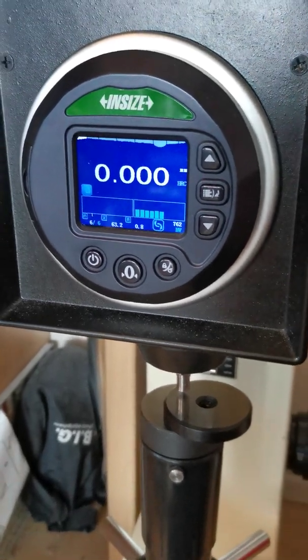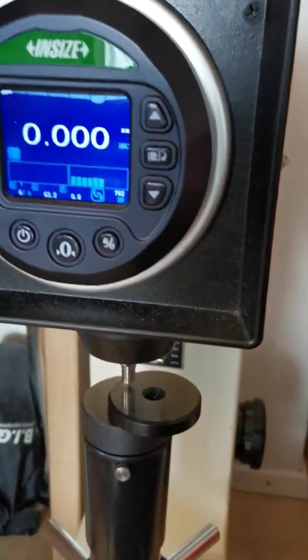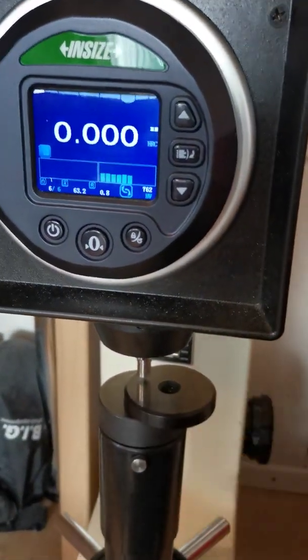Hello everyone. Today I do something that's probably not the most exciting, but it needs to be done every once in a while, and that's checking the calibration of your Rockwell tester.